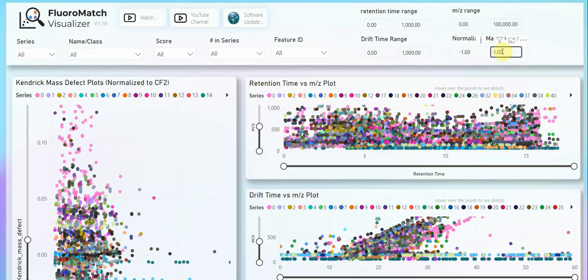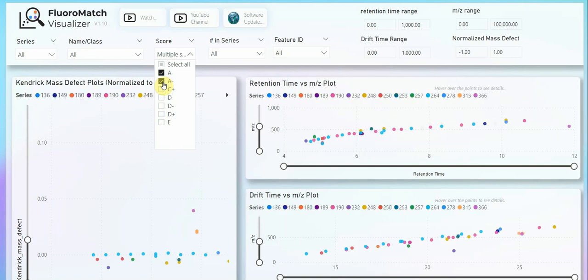For example, mass defect, if you want to adjust those that are likely PFAS. Usually I put this to negative 0.05 and positive 0.05. If there's certain drift time and retention time mass charge regions. But most importantly, we have a library of almost 200 CCS values for PFAS that was compiled by David Weil, and we'll continue to grow these libraries.